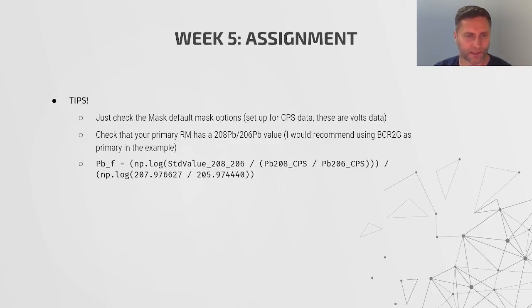Also, just to save you a little bit of time looking it up, this is the equation that you'll probably want to use when calculating the lead fractionation value. I've put in the atomic masses for 208 and 206 there for you, and you'll need to calculate these ratios here and understand what the rest of this equation is doing.